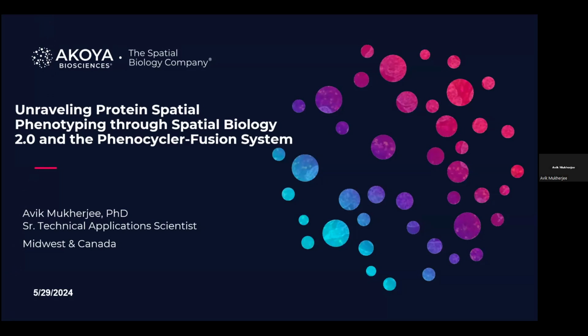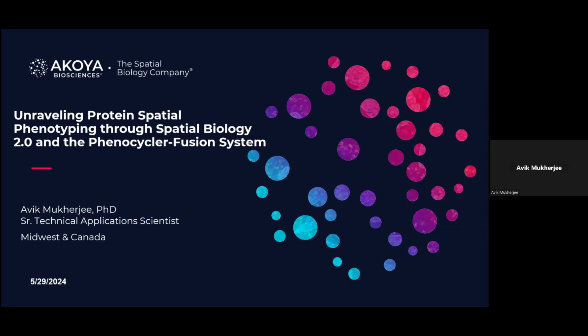Today, I'm going to talk to you about how you can use Akoya's instrument and the imager and the chemistry to do spatial biology. The talk would be divided into three parts: why spatial, how you do spatial, and what spatial biology can give you or answer your questions.